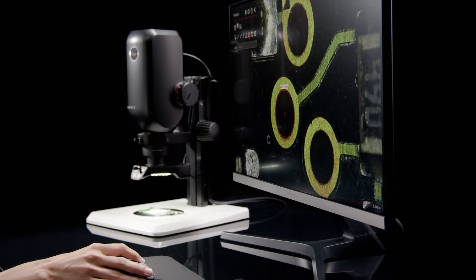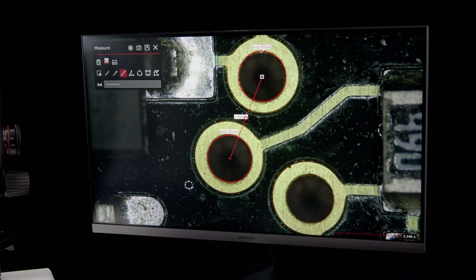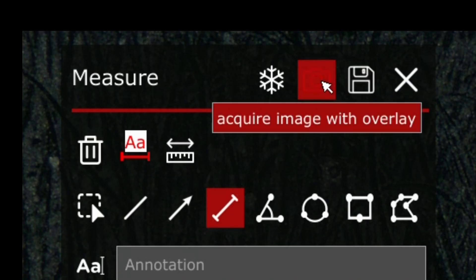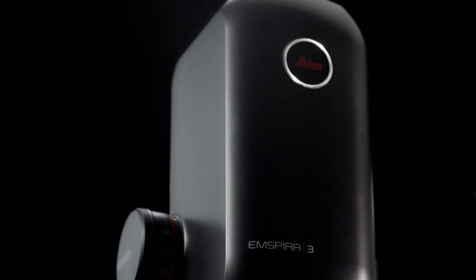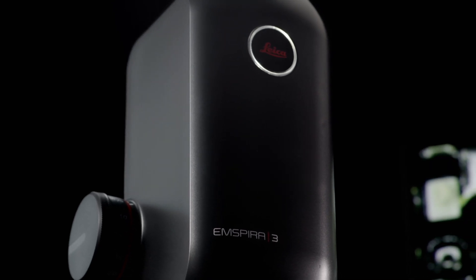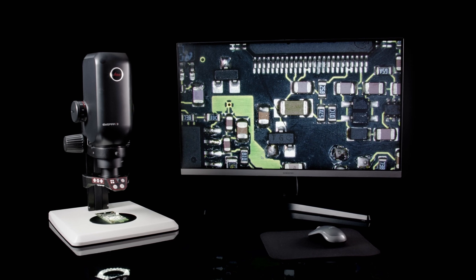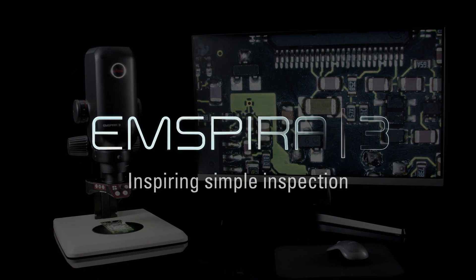Once you are done, store images and data on your local network so you can be confident they are available at any time. The Emspira 3 is an all-in-one digital solution for streamlining inspection processes while covering your needs flexibly, letting you work with confidence.